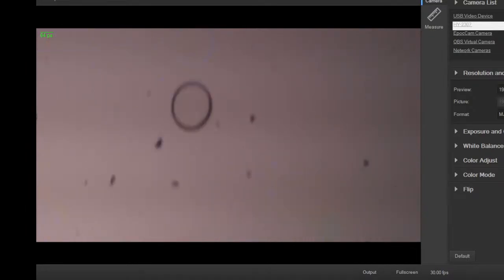And one of my favorites, one of the kind of Stylonchia guys, which is this kind of spiky, elongated, like a paramecium, but not as big, and very, very active, and has this funny jerky motion. It's like it's testing the waters, and then it bounces back, like, ooh, I don't like that, and it does that over and over and over again. So consistent behavior.